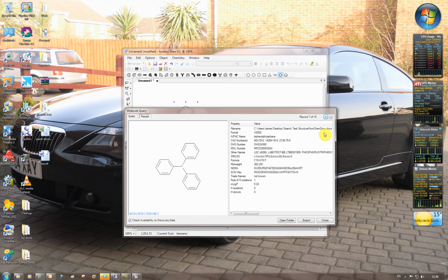I'm looking at maybe a way of generating a docx from the doc, and then we'll be able to use the same trick. But that might introduce some performance limitations. Again, it's pulled us out of a docx file, and then we have some PowerPoint files, a normal structure in a PowerPoint, and a newer PowerPoint file. And so those are the 10.